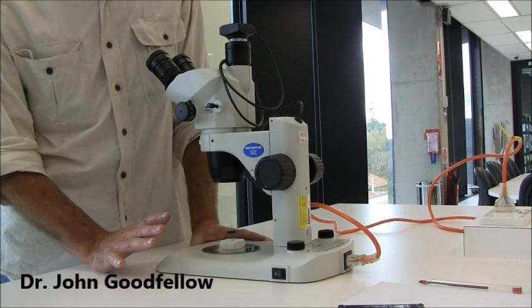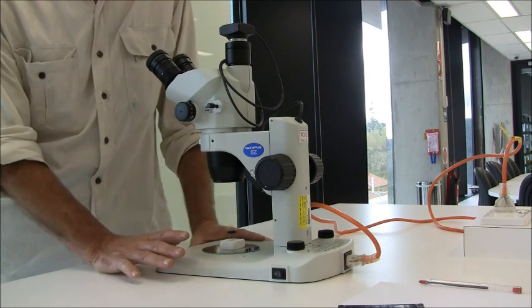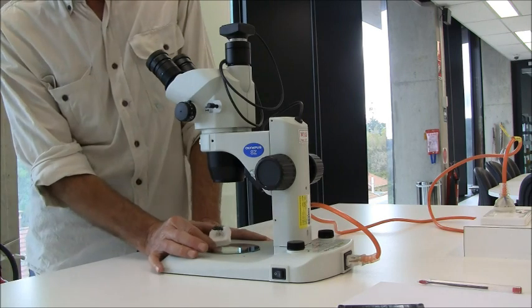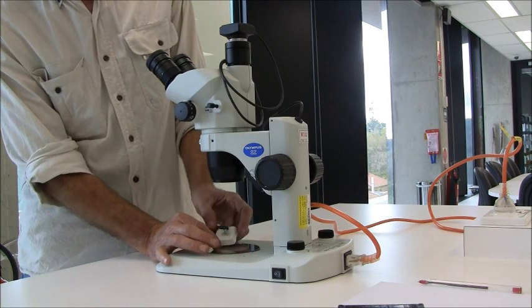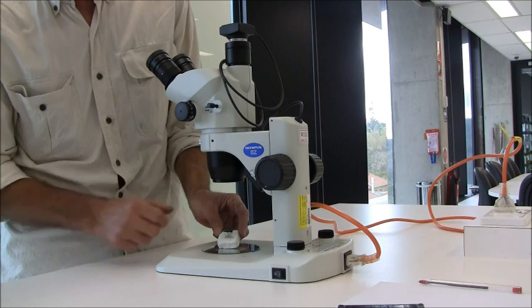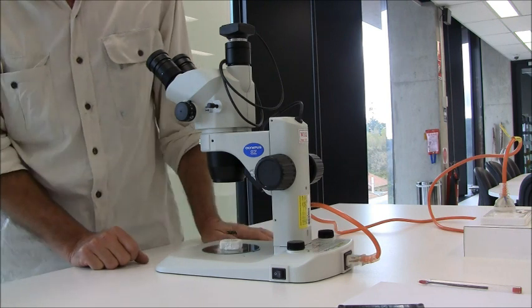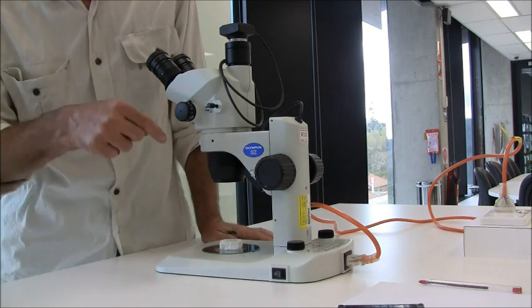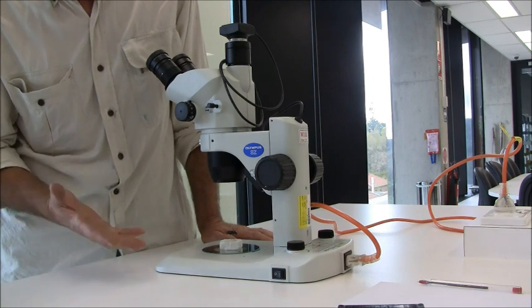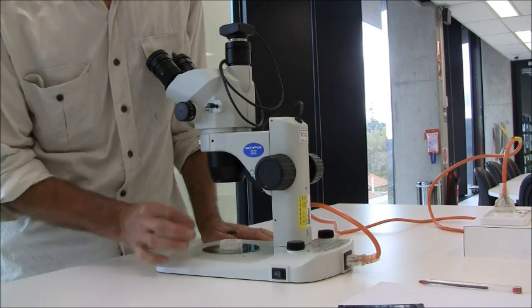This demonstration is on the dissecting microscope — a microscope used in molecules, genes and cells, and a little bit more in biology of organisms. It's called a dissecting microscope because you can do dissections under it. It doesn't magnify things very strongly, but you can see a lot of detail on specimens like insects. It fundamentally works by bouncing light off the specimen through a series of lenses and into your eye, different to the compound microscope which passes light through the specimen.